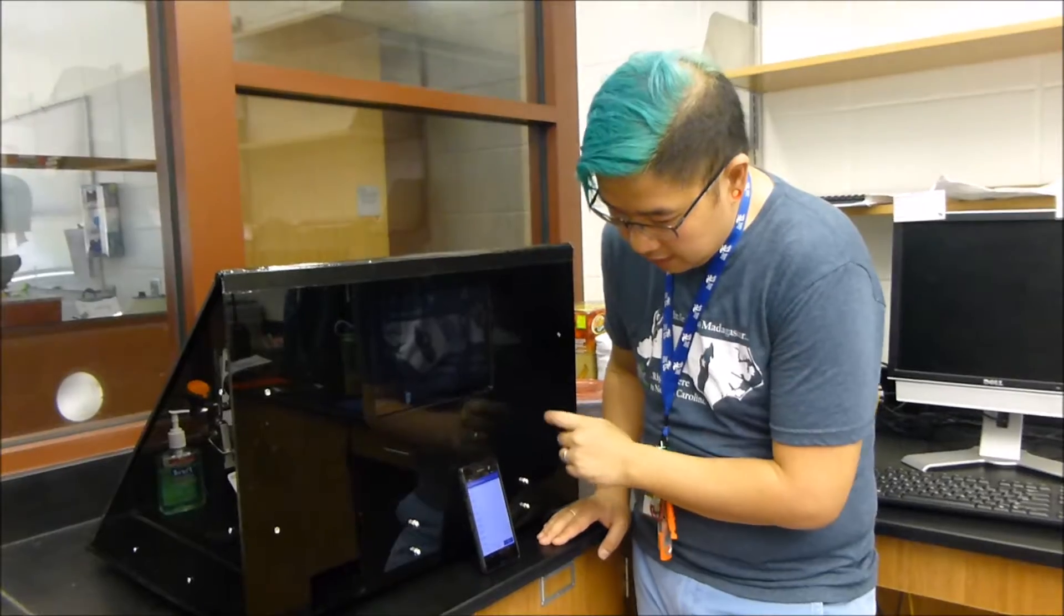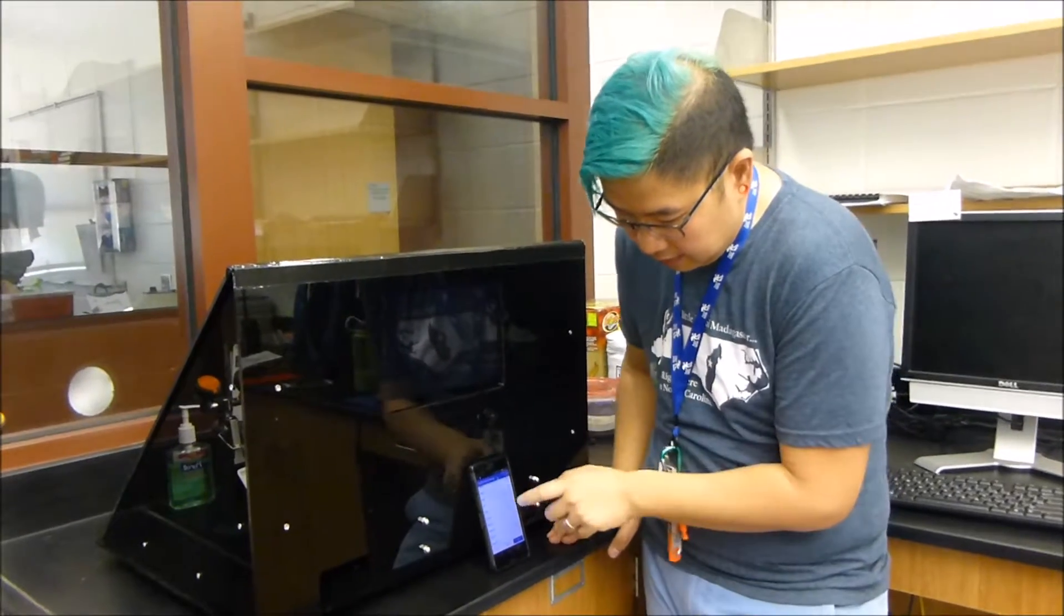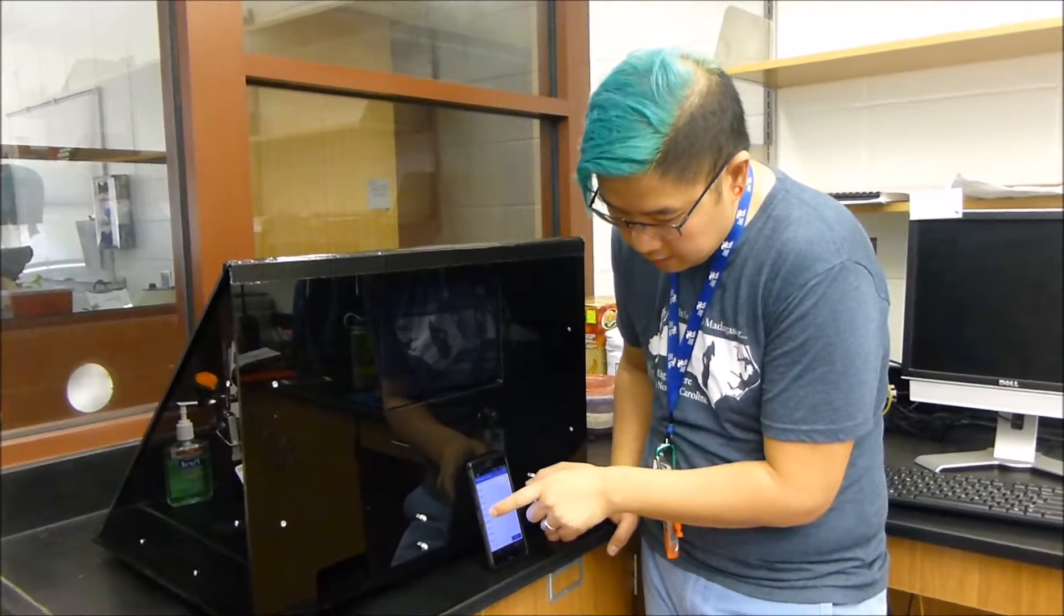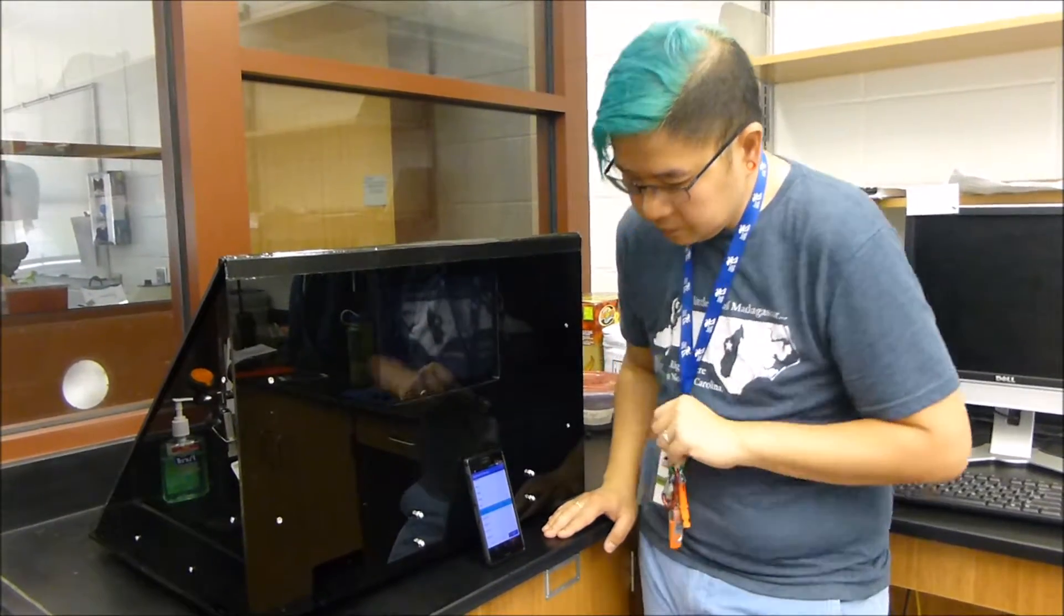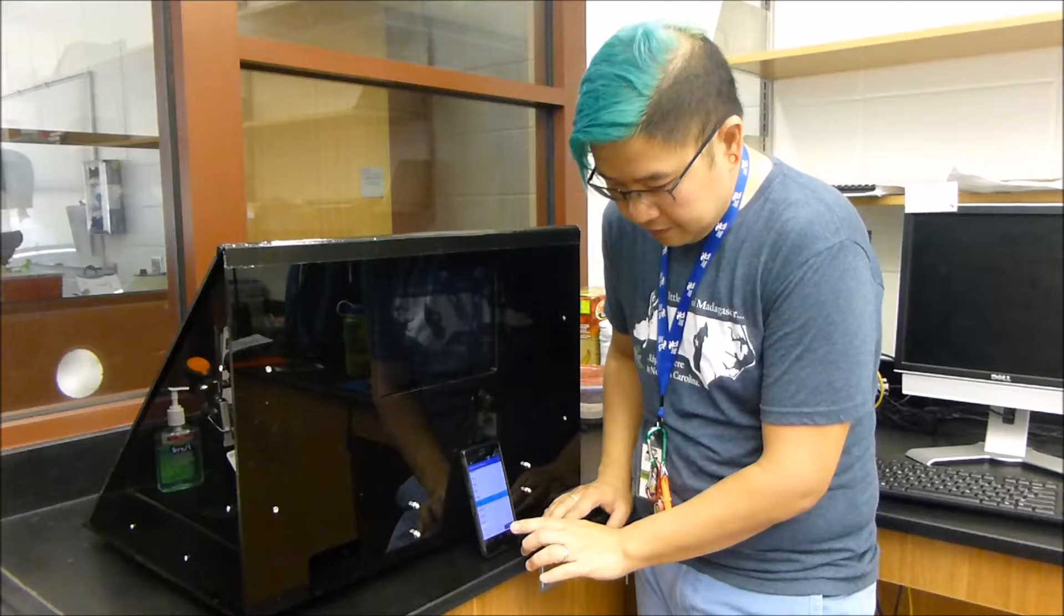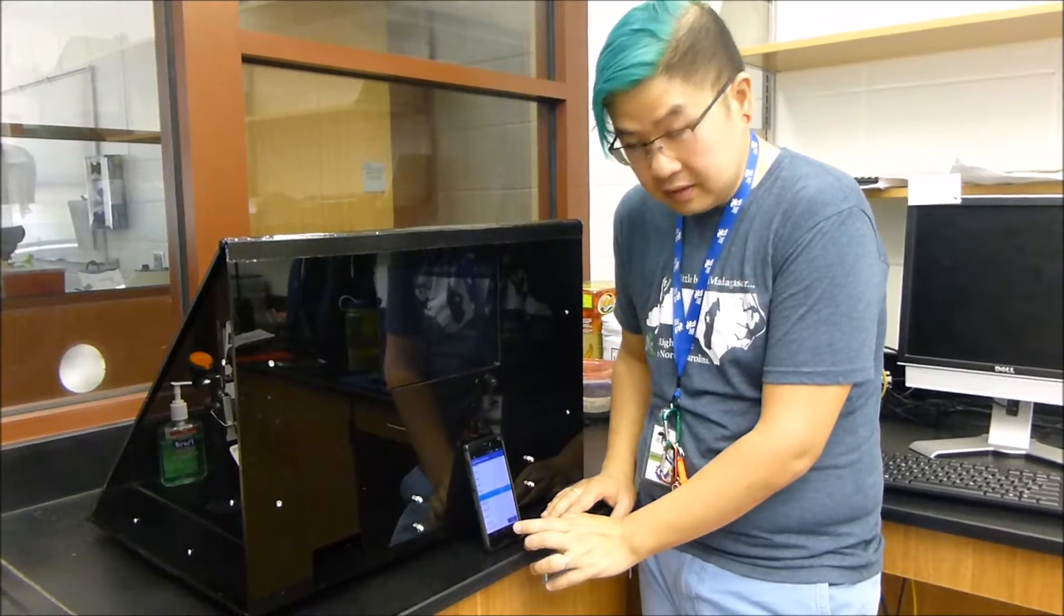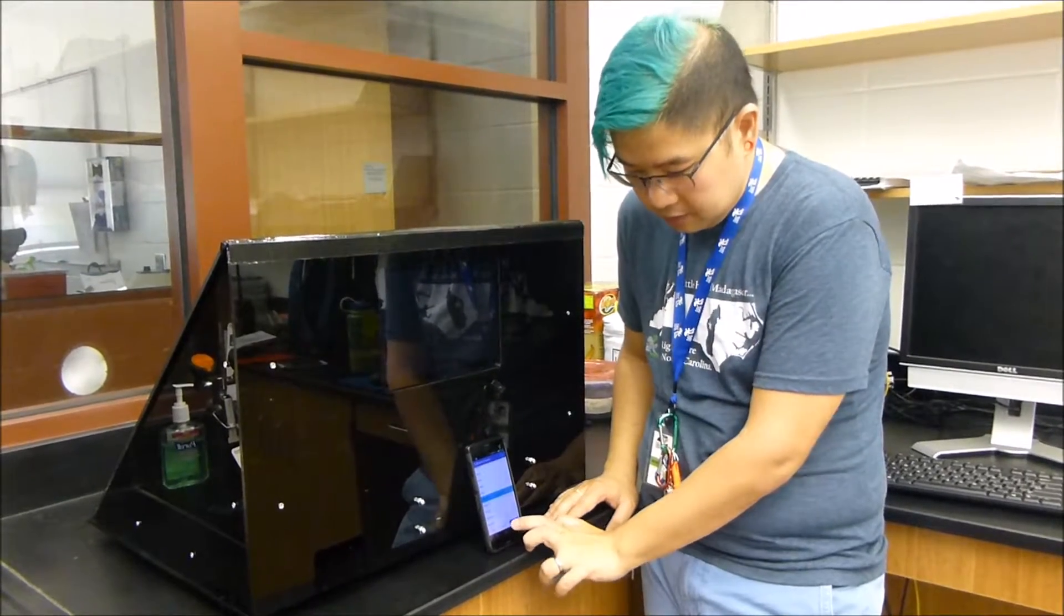So let's go ahead and pick subject one, and I'm going to hit the test two button.